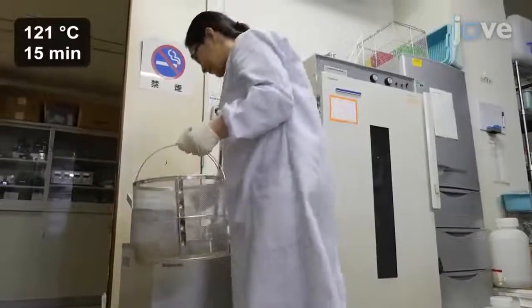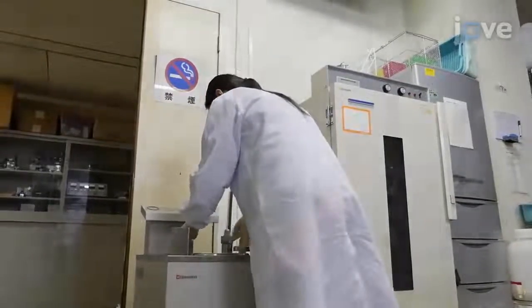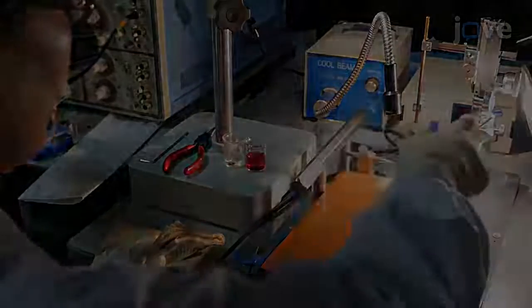Before the surgery, sterilize all the surgical instruments and a head post with an autoclave. Clean the stereotaxic frame and the heating pad.